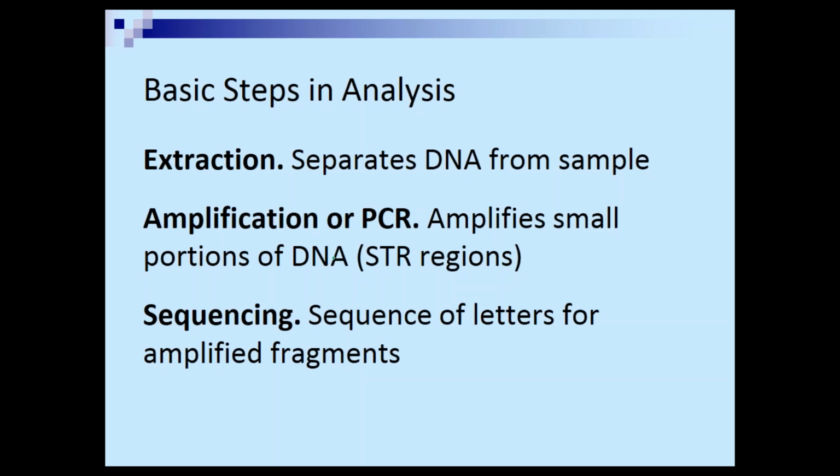Actually, whoops. Can you tell I just copied and pasted this slide? No, we're not going to amplify STR regions. That's wrong. We're going to amplify that 900 base pair area of DNA. So we're actually going to just put in one primer set that will amplify that 900 base pair area.